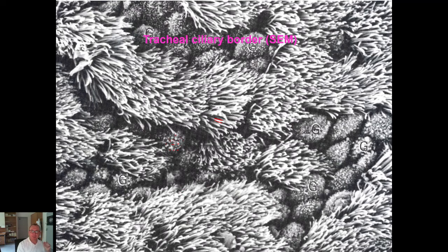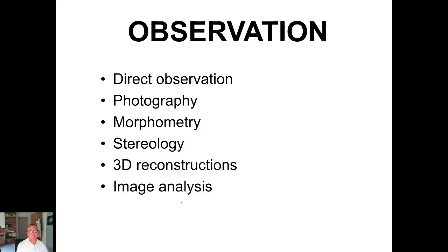It will be our next lecture. So you will know very early what I mean by the terms cilia and microvilli in the tracheal epithelium. And the last step of all histological methods must be observation, of course.